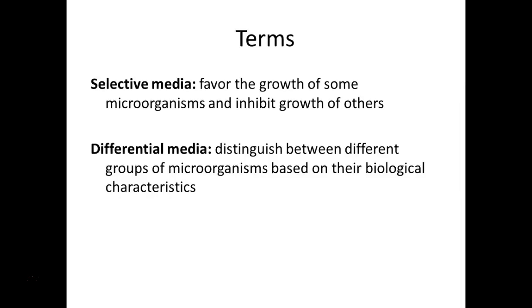So that brings us to the plate media that we're going to look at.